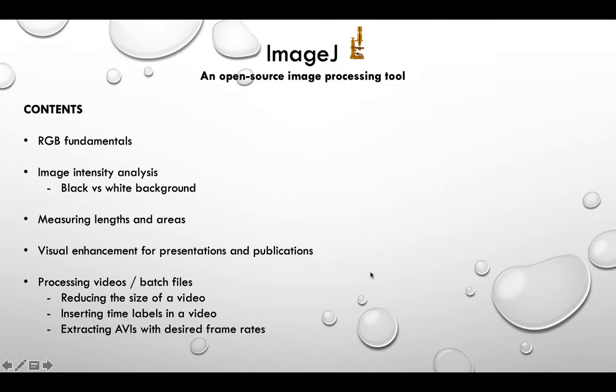What we'll go over in this video is some of the fundamentals of RGB. We'll understand how to quantitatively analyze image intensities. We will look at how to quantitatively measure lengths and areas within images, how to visually enhance images for use in presentations and publications. And finally, we'll conclude with how to analyze videos, how to reduce their size, label them with timestamps, extract AVIs with desired frame rates. These are some of the operations that we do routinely in our lab.